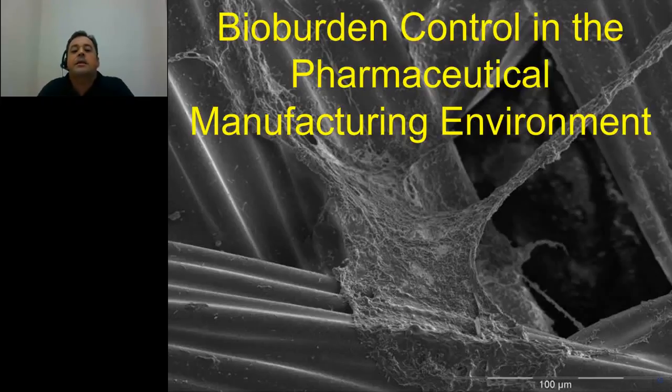All right. Now coming to the pharmaceutical industry, I like starting with interesting pictures. I really like this one. This one is actually from a reverse osmosis membrane. The larger structures that you see in it are actually the spacers between the membranes. So this is, of course, a microscopic view blown up.